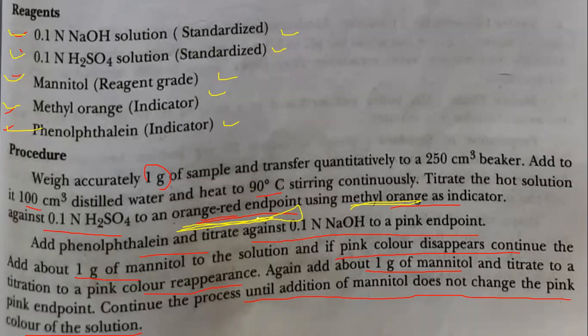After you get the end point, your alkalis have been neutralized. Now you proceed for detection of boric acid. So add phenolphthalein indicator to that and titrate the solution against 0.1 normal NaOH. You will get pink. Okay, then add again 1 gram of mannitol. If the pink color disappears, continue the titration.